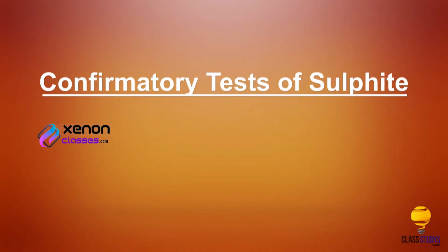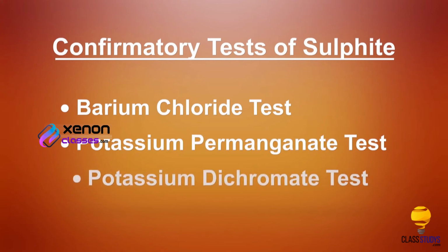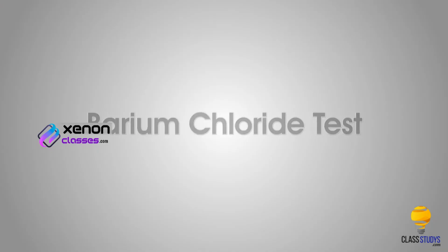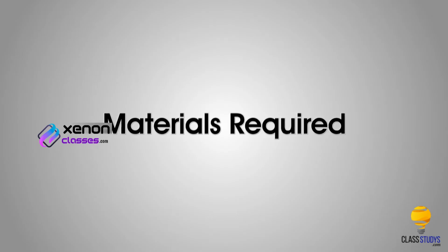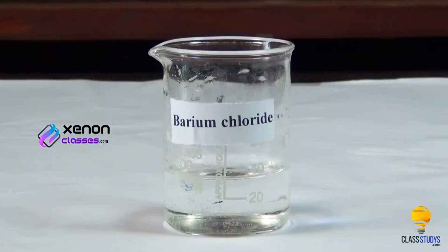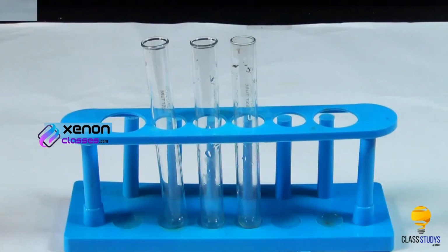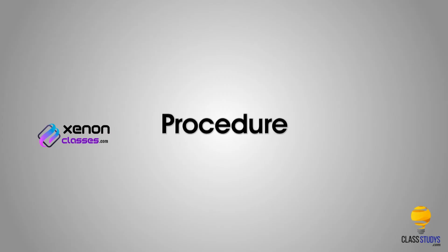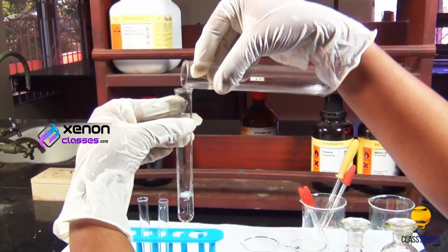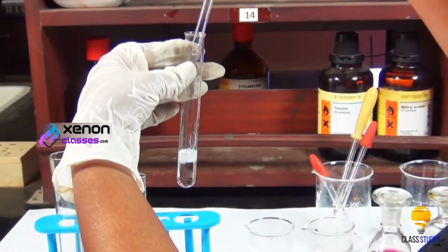The confirmatory tests are barium chloride test, potassium permanganate test, potassium dichromate test. Barium chloride test. Materials required: aqueous solution of the salt, barium chloride solution, dilute hydrochloric acid, test tubes and droppers. Procedure: take a small quantity of aqueous solution of the salt in a test tube. To this, add a small amount of barium chloride solution using a dropper.